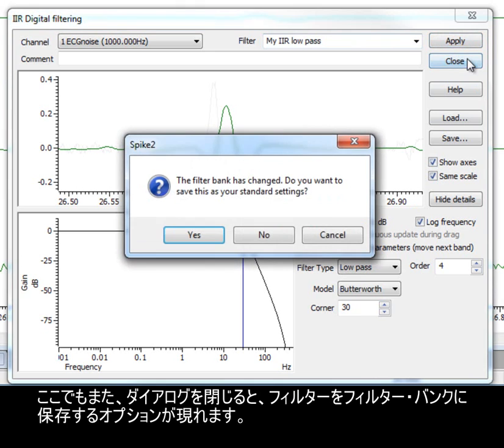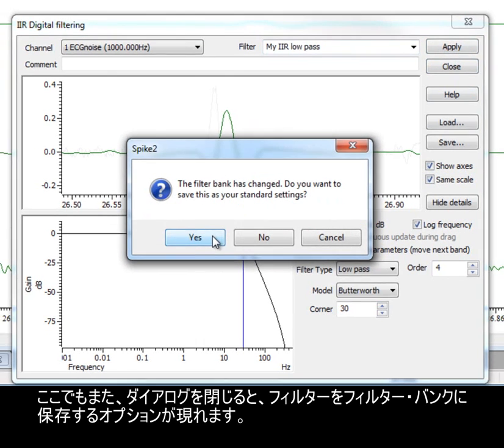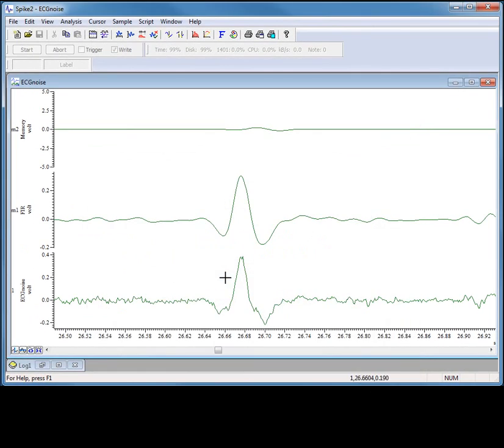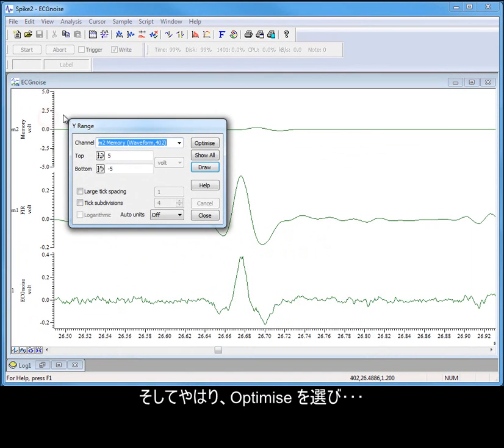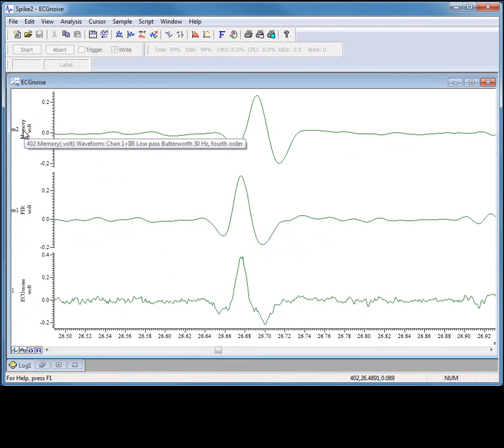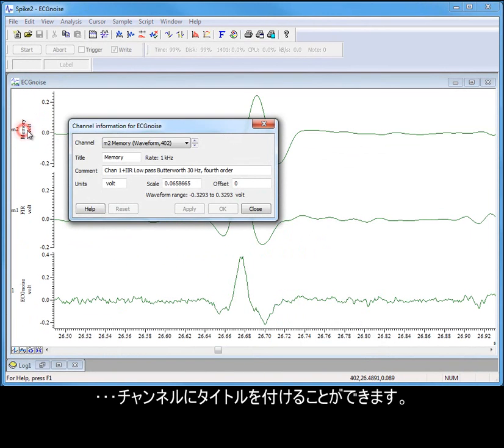Closing the dialog will again give us the option of saving it to the filter bank. Again, we can optimize and title the channel.